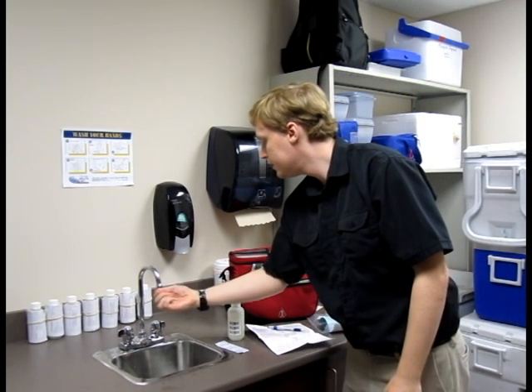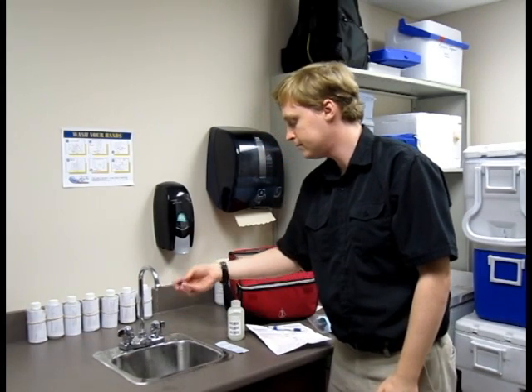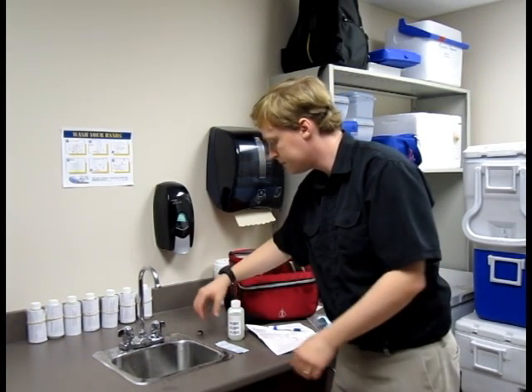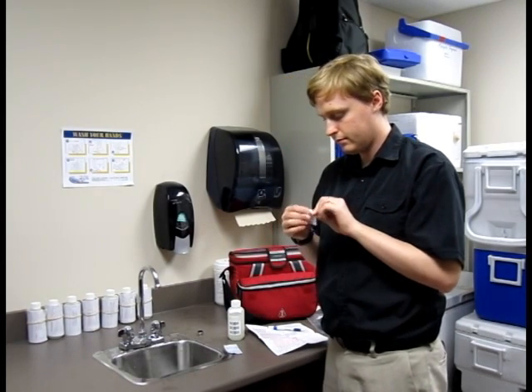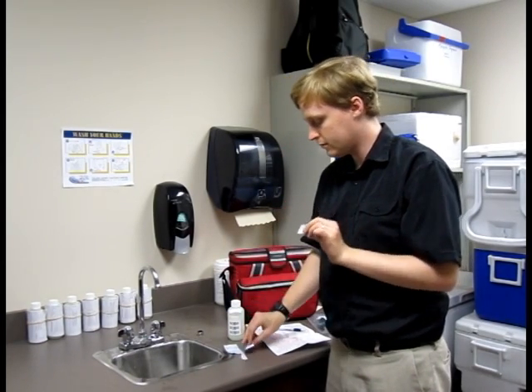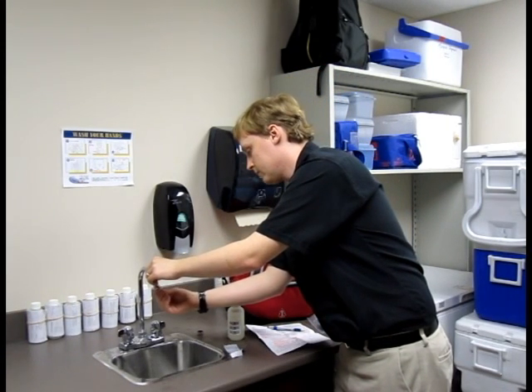Start the process by removing any attachments on the tap such as aerators. Because some back spray and food particles can contaminate the inside of the tap, it is recommended that you wipe the inside of the tap with a disinfectant. You can use a cloth soaked in a mild bleach and water solution or an alcohol swab.